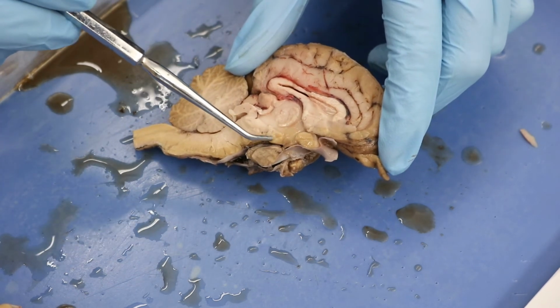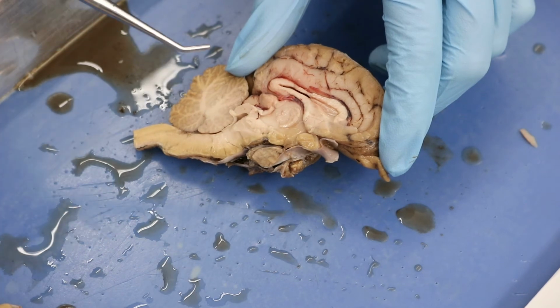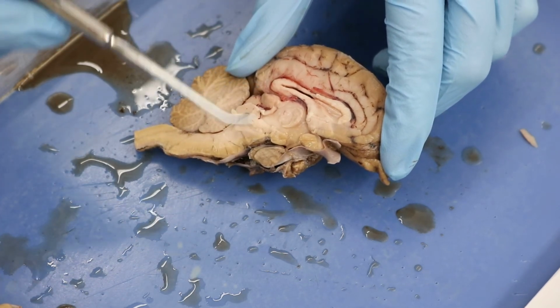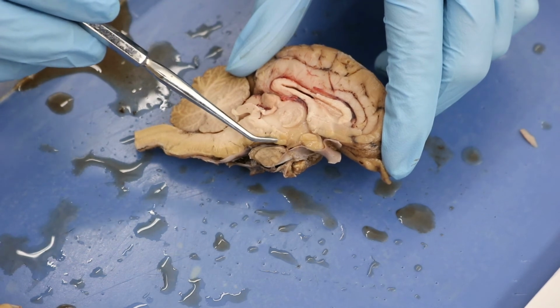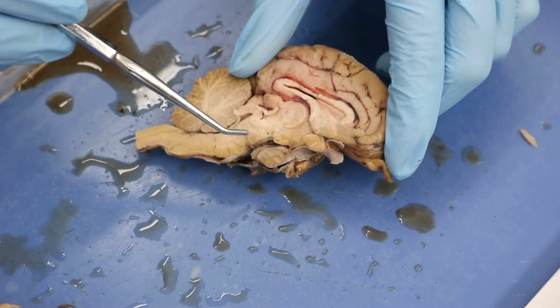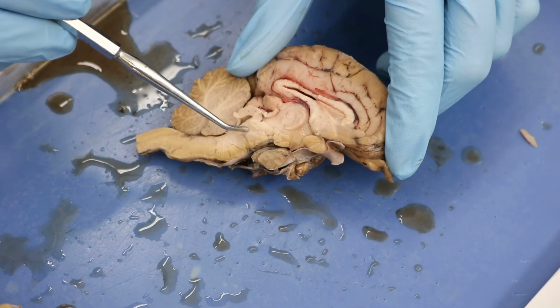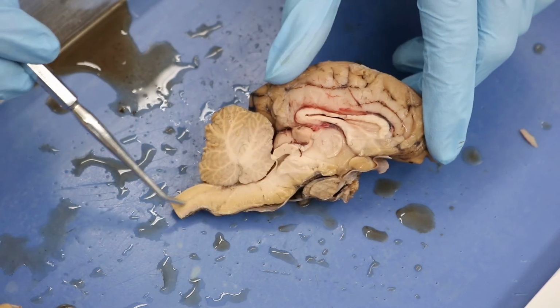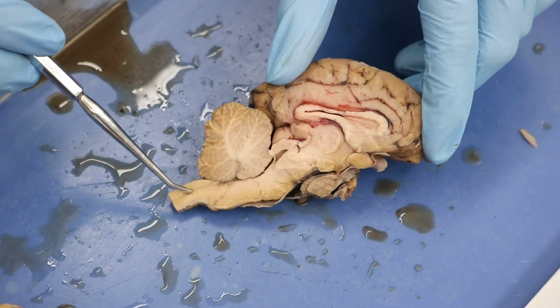Now, just under his snout area, this kind of spot here would be the mammillary bodies. Mammillary bodies is right here, okay? We also have the midbrain here, the pregnant seahorse's belly, the pons here, and our medulla oblongata.